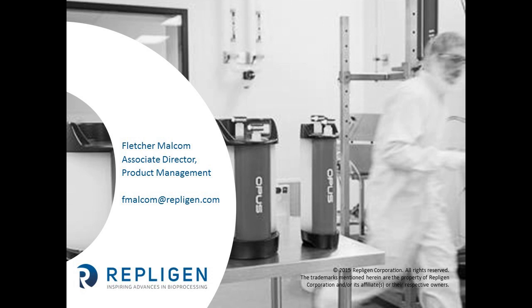So what does it mean when you say multi-use, and how many cycles can be run on the column? Yeah, that's a really good question, and the real answer is it depends. It depends on your process, and it depends on the cleanliness of your feed stream. But in general, what we found is if you have a well-developed process and you have mechanisms where you're filtering out the bad stuff that might clog the head of the column, then our columns can be run for potentially hundreds of cycles. We've done analysis in our internal lab to show with buffer recirculation that the packed bed and the column hardware is stable to right around 100 cycles. We haven't gone further than that, but that's where we stopped the experiment.